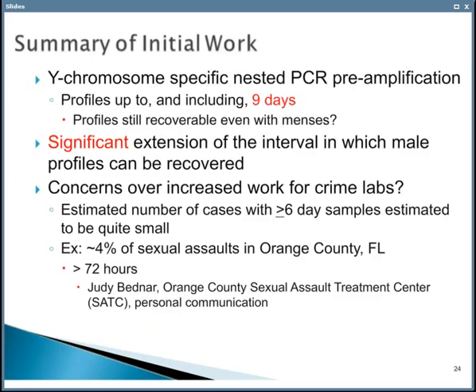So what my lab has done over several years is we've developed several methods. To summarize some of this early work, we've developed Y-chromosome specific nested PCR amplification. Basically, we took the Yfiler kit and designed nested primers to improve sensitivity, so that we were able to get profiles up to and including 9 days after intercourse.